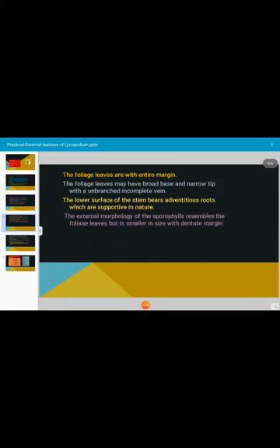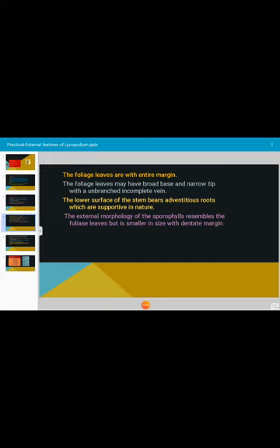The foliage leaves have entire margin. The foliage leaves may have broad base and narrow tip with unbranched incomplete vein. The lower surface of the stem bears adventitious roots which are supportive in nature. The external morphology of sporophylls resembles the foliage leaves but is smaller in size with dented margin.